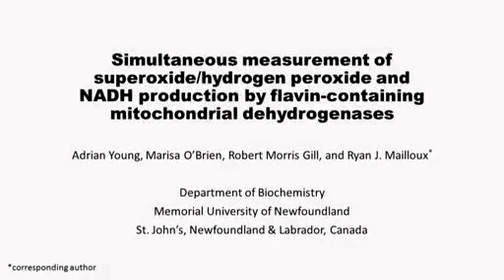The overall goal of this procedure is to quantify the superoxide, hydrogen peroxide, and NADH production rate of purified flavin-containing mitochondrial dehydrogenases using microplate fluorometry.